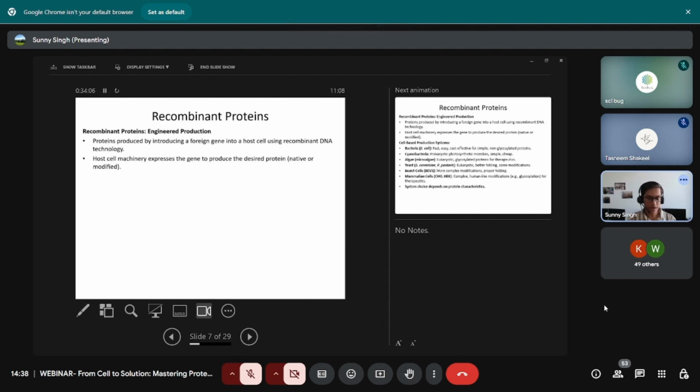Plasmids are circular DNA, and when you linearize them by cutting with a restriction enzyme, they become linear. Then it's easy to see when they run on an agarose gel, because if the plasmid is circular, it runs at a different speed. It doesn't run according to the size. So when you run a DNA marker or a ladder and you run your plasmid, which is, let's say, 4.5 kb, if it's circular, it will not run at 4.5 kb when you match it with the DNA ladder. It will run maybe higher or maybe faster. It depends. So you always have to at least cut it with one known restriction enzyme, which will cut it in one place and linearize it and open it up. When it's open, it will run according to the size. Then you will be able to identify whether your plasmid DNA is actually 4.5 kb or something else.